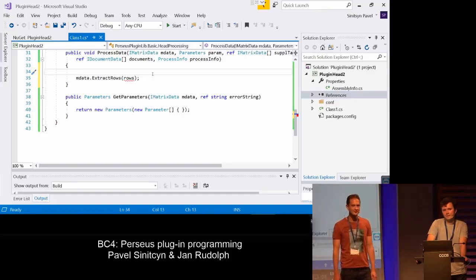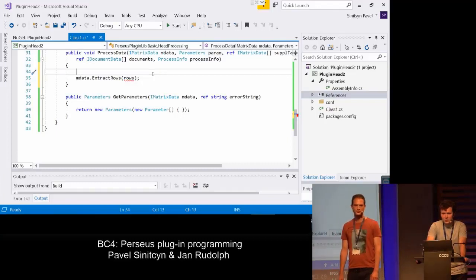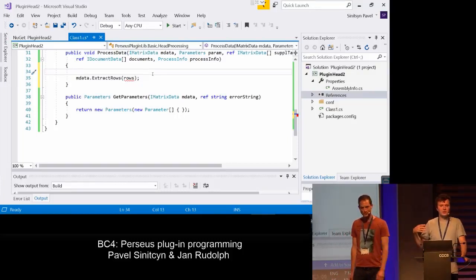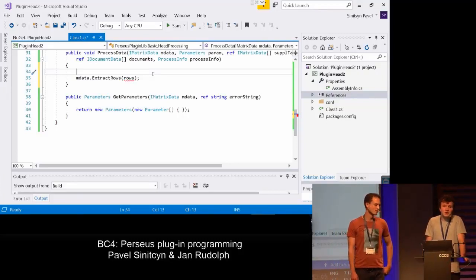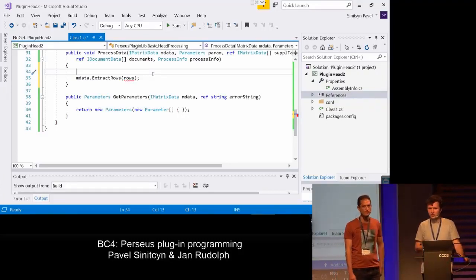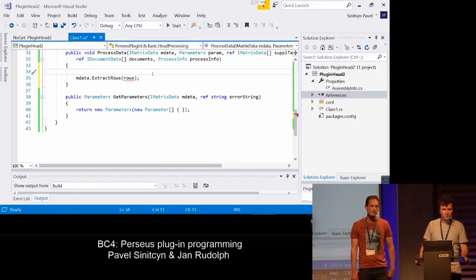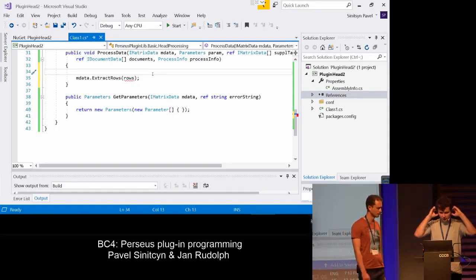Yeah, you can't search for the function or class in Visual Studio, right? Because this part of Perseus is not loaded. So you need to search in GitHub. Yeah, there are two options here. You can basically load this GitHub repository to your computer and do it like in Visual Studio. Yeah, okay. But here it's so simple that we're just searching it like this. Yeah, okay. It's just a matter of taste. Okay, but if I load it, I could search it, right-click and show source and so on. Yeah, it's much simpler. Okay, good.